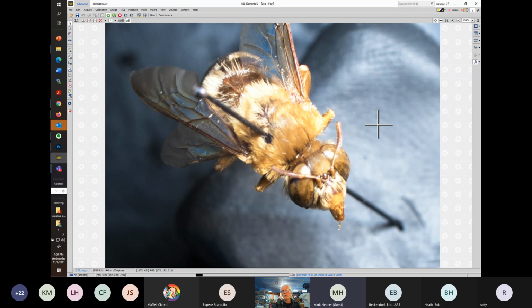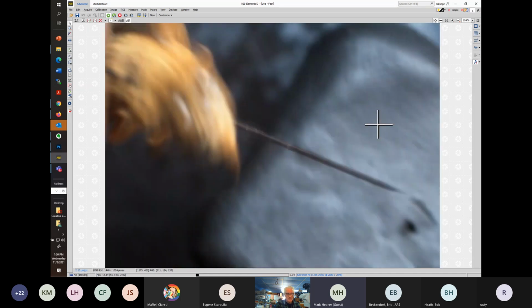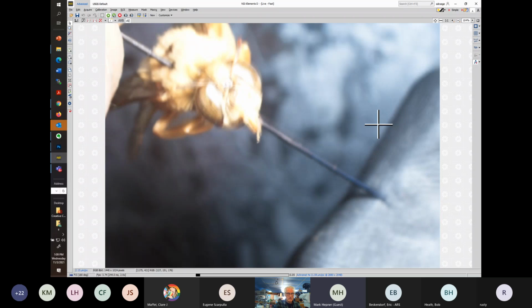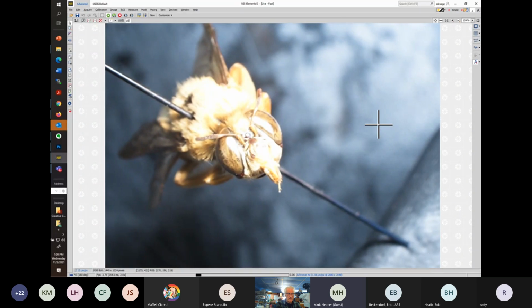And the fewer questions you have to answer to get to an ID, the fewer chances you have of actually making a mistake along the way too, of course. Either inadvertent, like, oh, you pressed the wrong button, or because maybe you misinterpreted something. So if we take a look, this is a male. I'm not going to go through how we look at males, because you guys have been doing this for a while. And if we look at the face, a couple things sort of stand out.